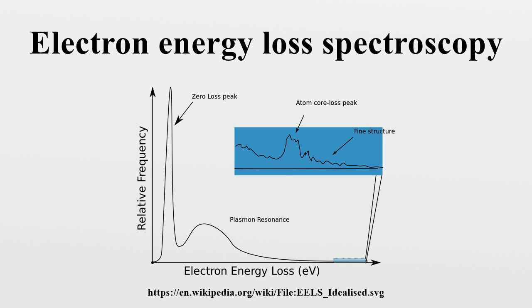Here MFP is the mean free path of electron inelastic scattering, which has recently been tabulated for most elemental solids and oxides. The spatial resolution of this procedure is limited by the plasmon localization and is about 1 nanometer, meaning that spatial thickness maps can be measured in scanning transmission electron microscopy with ~1 nanometer resolution.